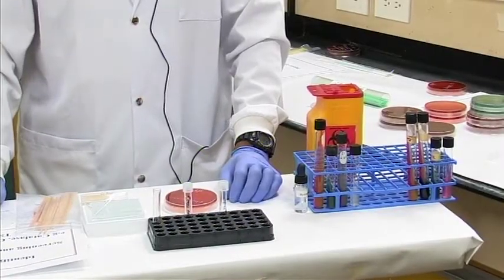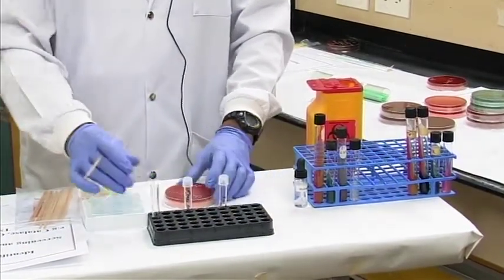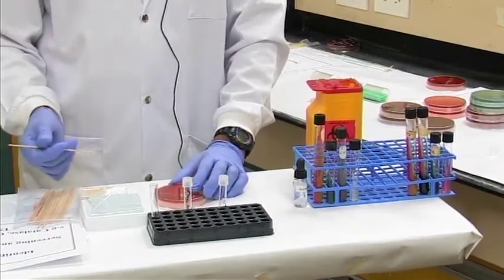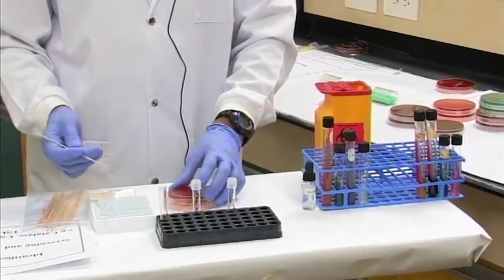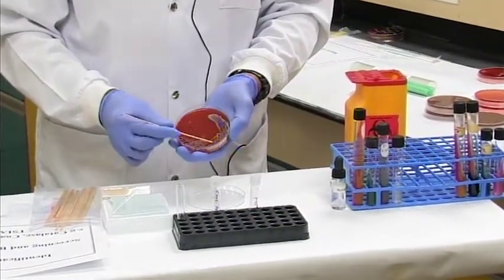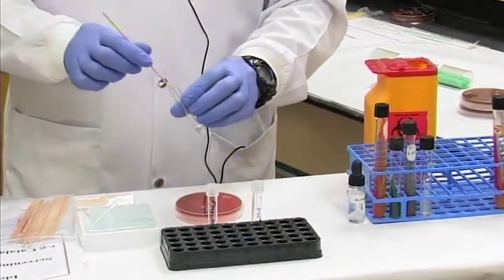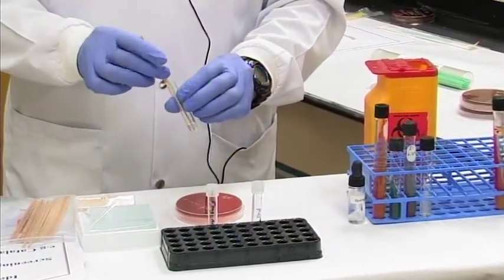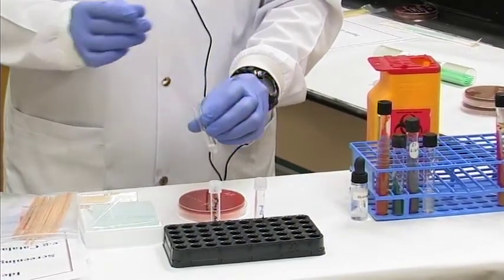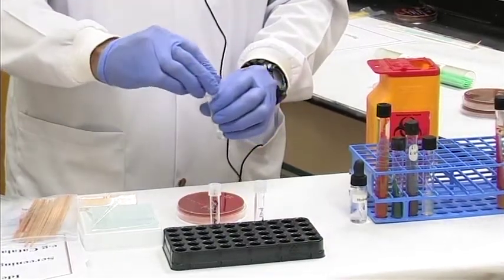So to demonstrate the coagulase test, what we'll need is some coagulase plasma, and we'll need our bacteria. So we're going to pick up an inoculum of our test bacteria here and inoculate it into our tube with plasma. Discard in a biosafety container or biohazard container.